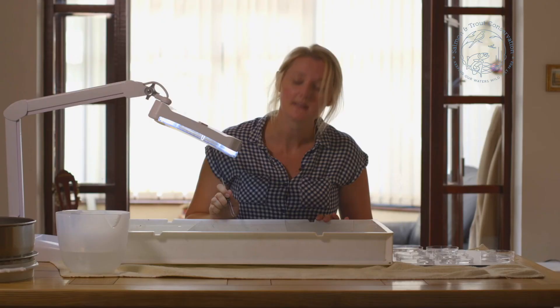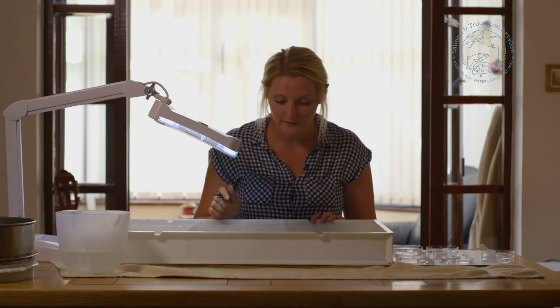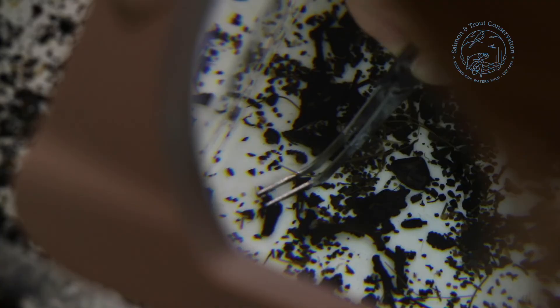At this point everything's been sorted through, but it's going to take me another couple of hours at least to get all of the animals out. If you need to, at the end of the day run everything through your sieve, put it back in alcohol, and start again the following day — that's absolutely fine. It takes you as long as it takes you. The important thing is getting everything out of there.